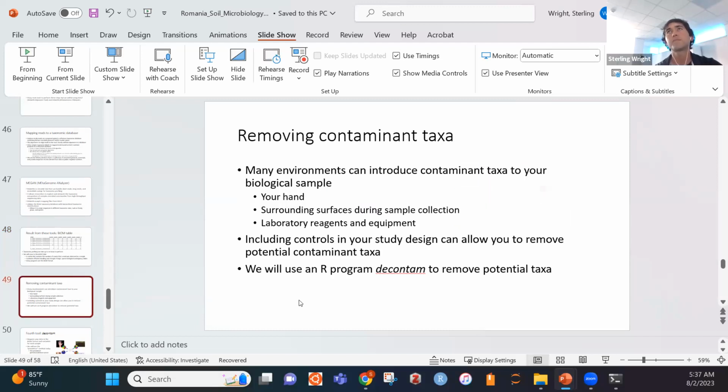So we talked about all these different steps and tools. Oh, Arena has a question. Since these programs output a BIOM table with read counts, do these programs have any sort of compensation for different bacterial genome sizes? It's a larger amount of reads.